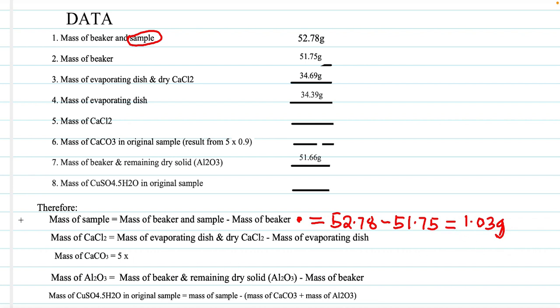All right, now we proceeded to the next stage. Remember they told us to weigh the evaporating dish when it was empty. Of course, they will give the evaporating dish. Now remember our sole aim is to separate a mixture.